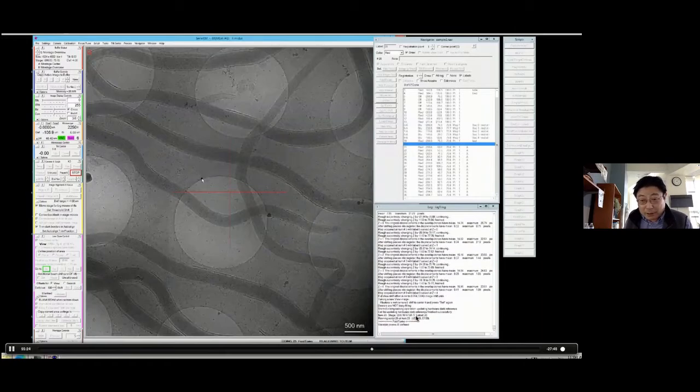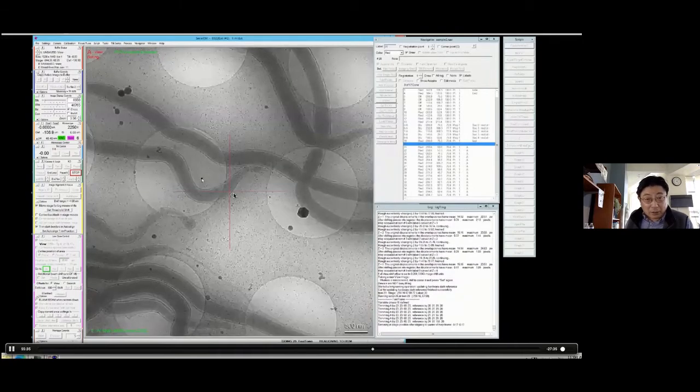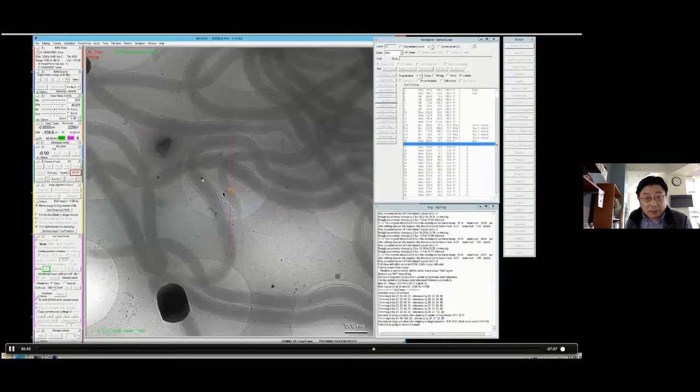This is the start of fast tomo, and then they call realign to item. Basically, make sure you find the item that you selected for data collection. Clearly, I did not select this area because this is on the carbon. I selected this area, so they find this area by doing cross correlation with the previously recorded image.